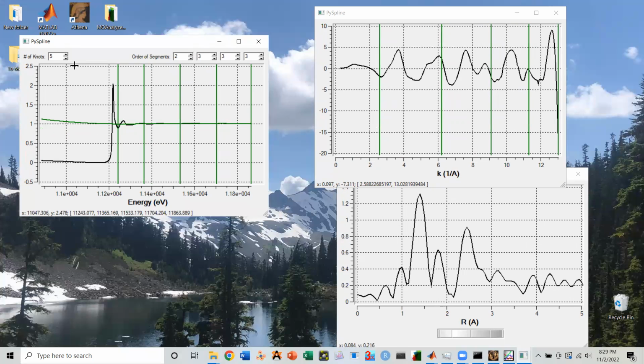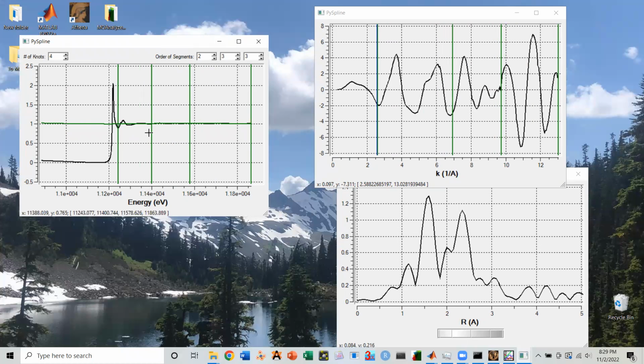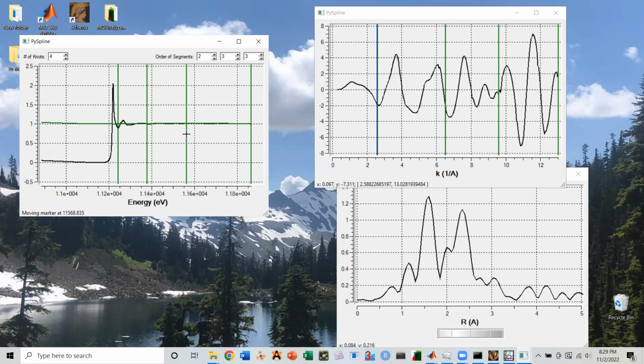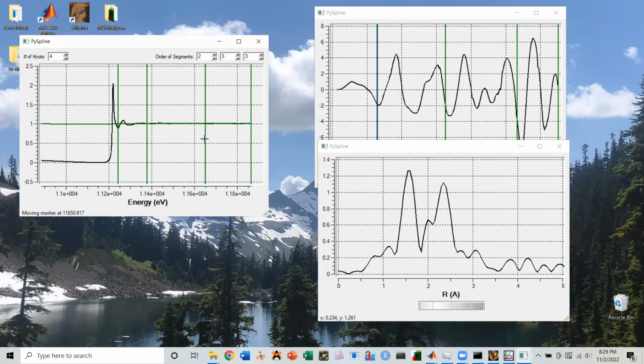Yeah, no, I'm pretty unhappy with that extra segment. So we'll go back to this. Let's see if I bring this back out. Doesn't really do a whole lot. That's not really doing much. So this is probably going to be about as close as I'm going to be able to get this. So you can see now with this final switch, you can kind of watch the intensity of these 2 peaks here. And I am trying to maximize the intensity while minimizing those low R components. I think that's probably as close as I will get here.